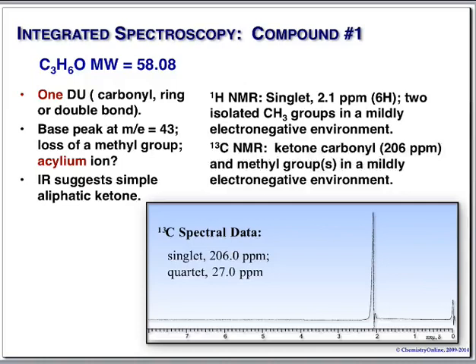Yeah. So when you don't have that labeled singlet and quartet, how do I identify this on here? What, identify what? Like, is it one of these lines? Yes. Because for the lab, we had all these lines and everything. Well, see, this just avoids having to print the spectrum, frankly. This says we have a peak here at 27 parts per million.